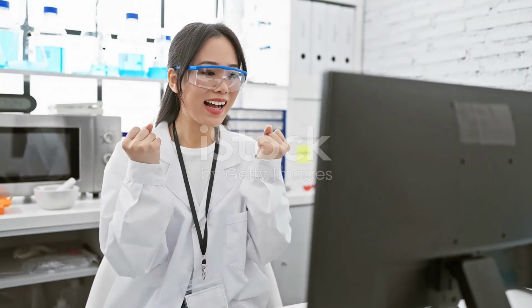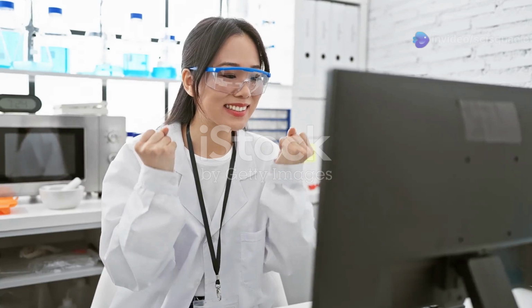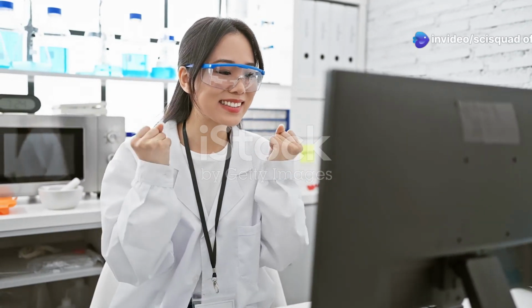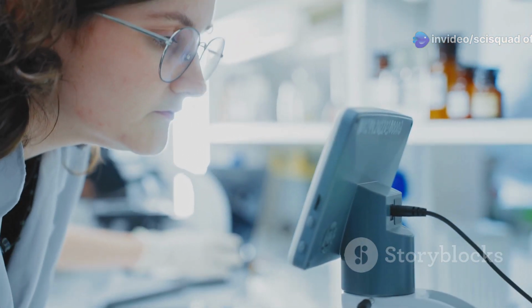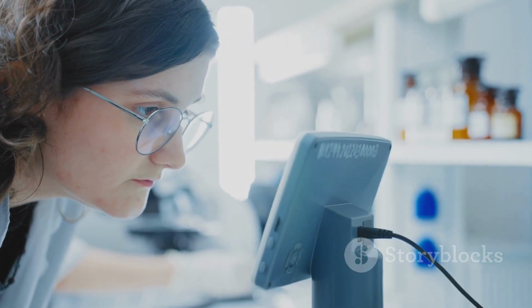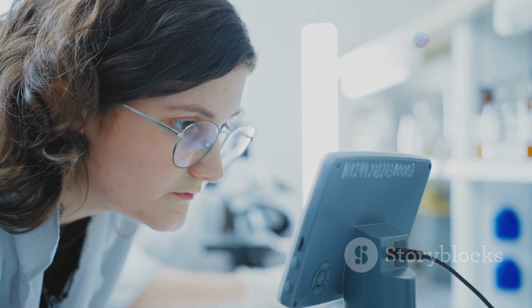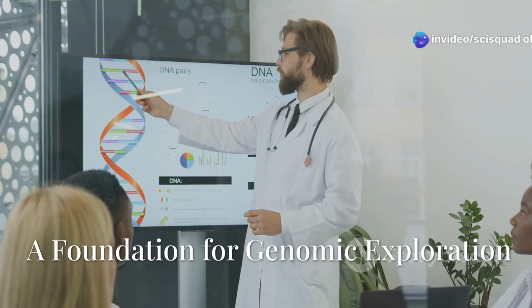Despite these limitations, Sanger sequencing remains a valuable tool, especially when accuracy and cost-effectiveness are paramount. It's like a trusty microscope, ideal for examining individual cells or small objects, even though it may not be suitable for studying the entire universe.